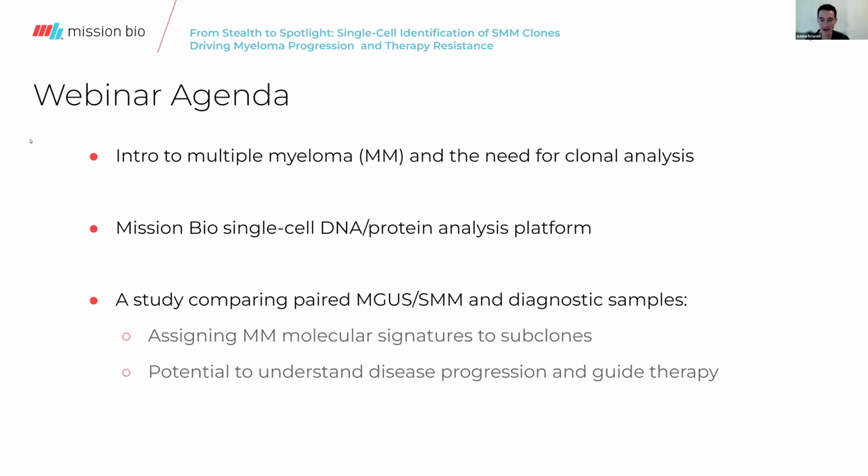So the webinar is going to be divided into three parts. We'll have an intro into multiple myeloma, and specifically how, as a disease, it really needs to have clonal analysis to understand, to diagnose, and to treat. Then we'll talk about the Mission Bio platform, its DNA and protein analysis, and how it can meet the needs of multiple myeloma.